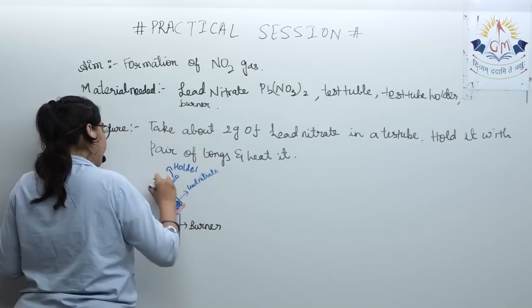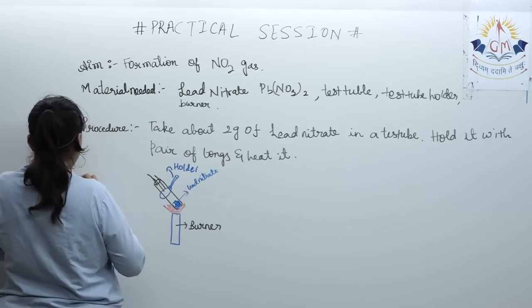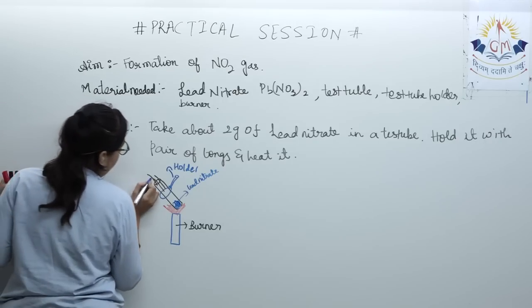From here, the fumes which come out are of brown color.